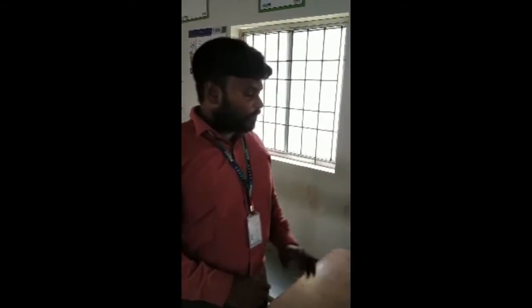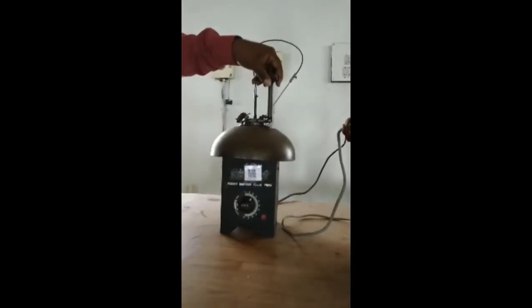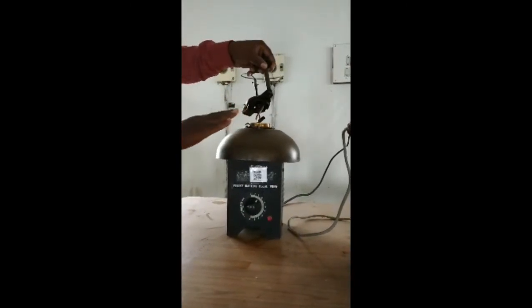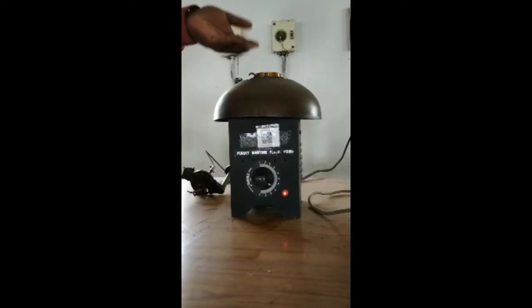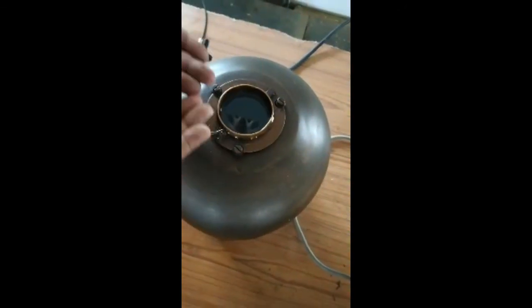It's a very simple experiment, and you can do it with the help of this apparatus. Now what you will do is open this up. This is the lid, which closes the oil. You have to turn it on, and now it lights up. You pour oil up to the brim. There will be a circle, and you fill the oil up to that circle.